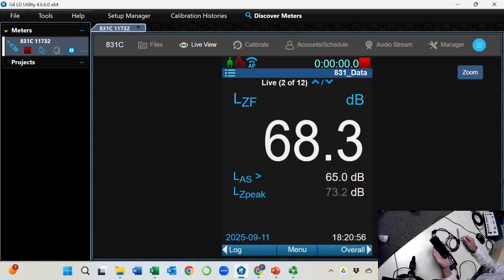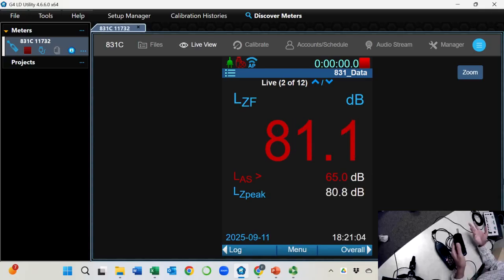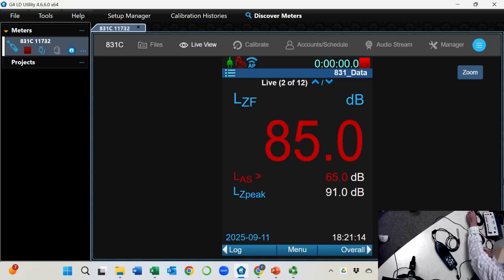No. There's no off button. Then how do I turn it off? It will be on forever. No. It will be on for 1 minute, exactly 60 seconds. Am I making sense? So I'll just leave it there, and it should turn off in 60 seconds.